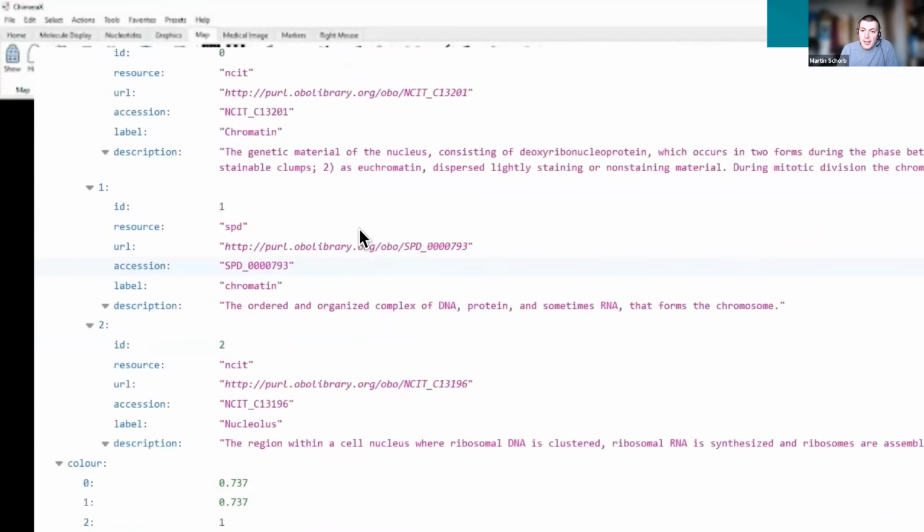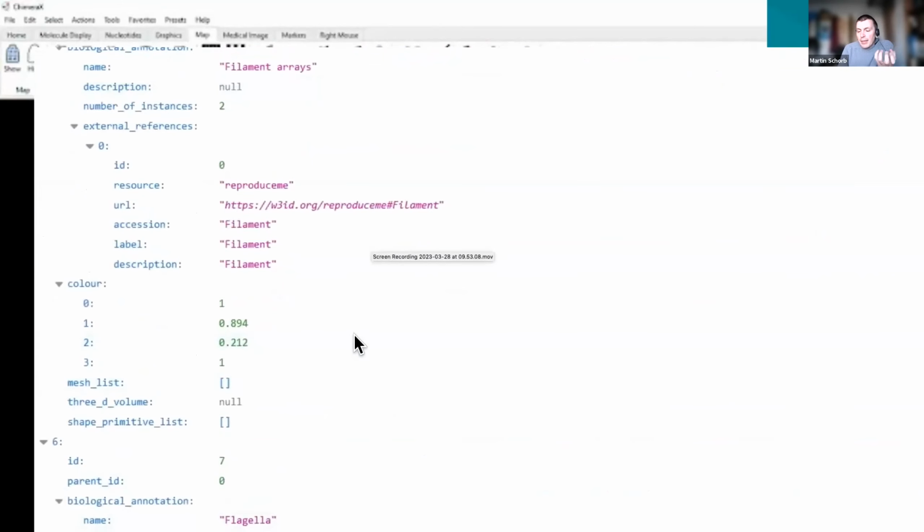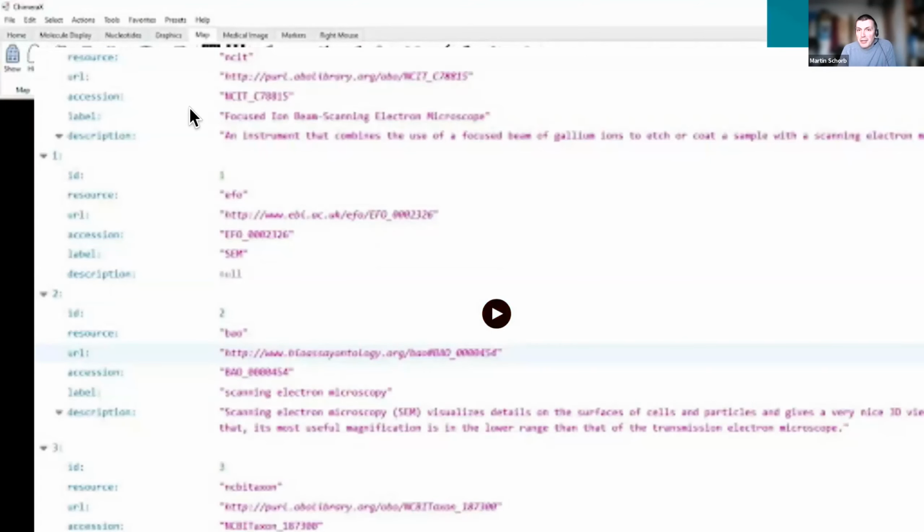Has eye spots, right? And the nice thing is that this is all part of that segmentation file. So you could think of looking for mitochondria collected in the Mediterranean, and because we deposit it that way in the archive, you will find our data set, because all these annotations are available together with the segmentation.